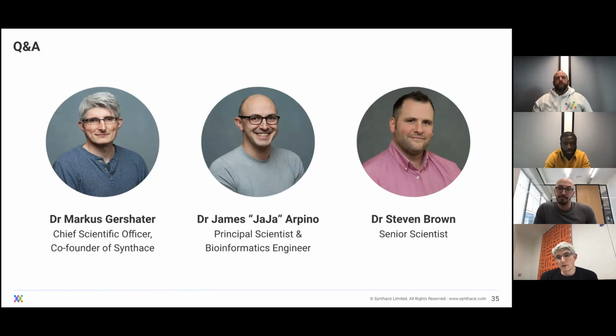Yeah, exactly. There might be a higher level point to make here, just in case people aren't aware, but Synthace isn't itself a platform for designing experiments. It's a platform for executing experiments. So yeah, the design can be done in something like JMP and Design Expert. But as you may have noticed with the experiment that Steve put up, even for 32 runs, it can look really quite complex to run.